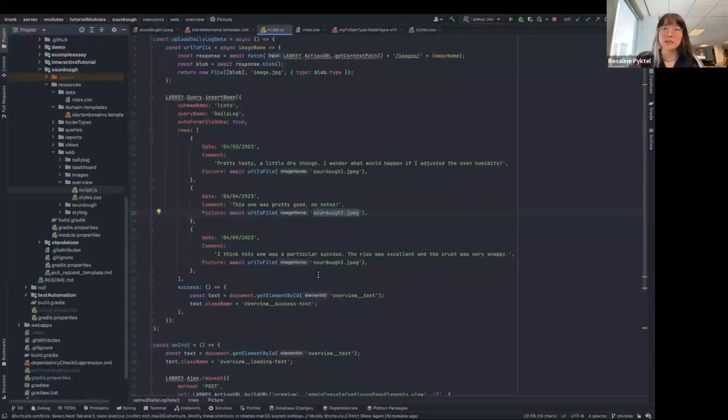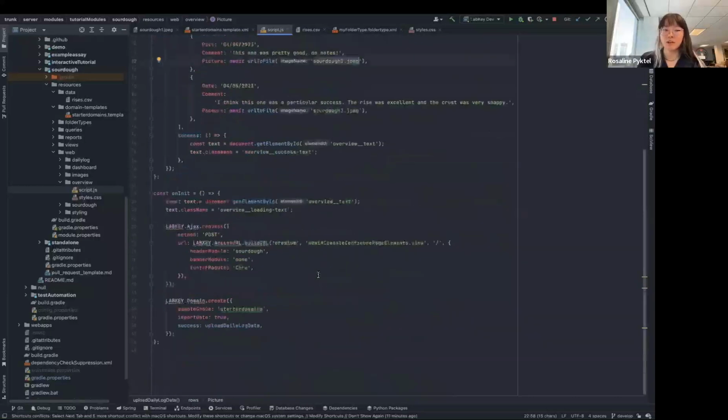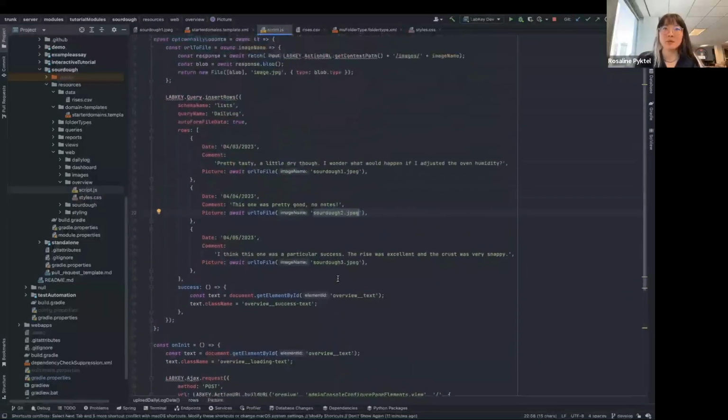One simple idea is to have a list with a data row bit flipped to false, indicating not initialized. Once somebody lands on the main page of the folder, you can check via JavaScript against that bit that the folder is not initialized, run initialization functions, and then flip the bit to true for initialized so that you never even have to click a button.